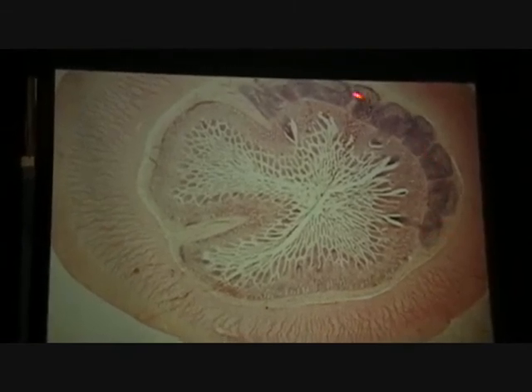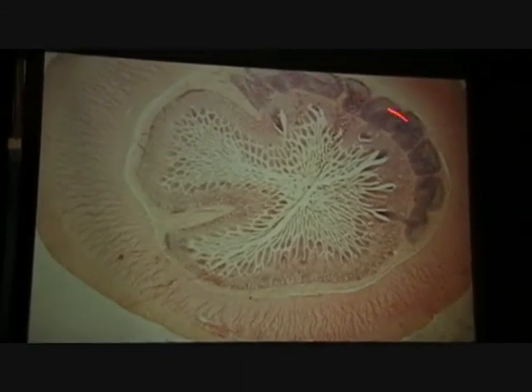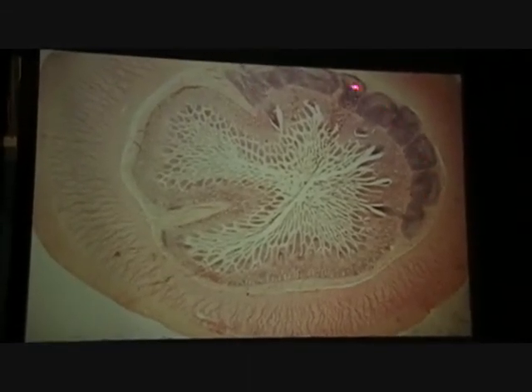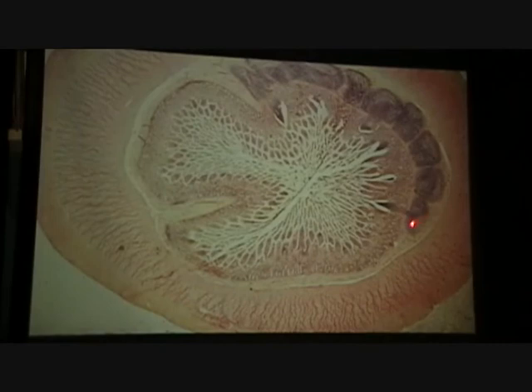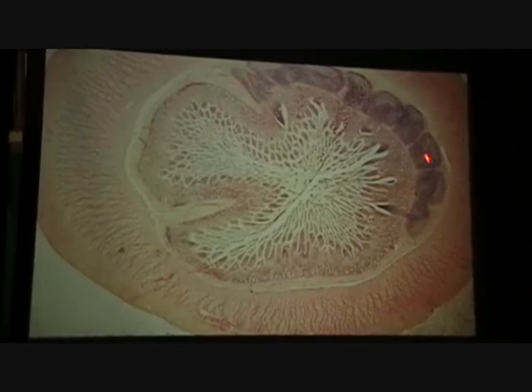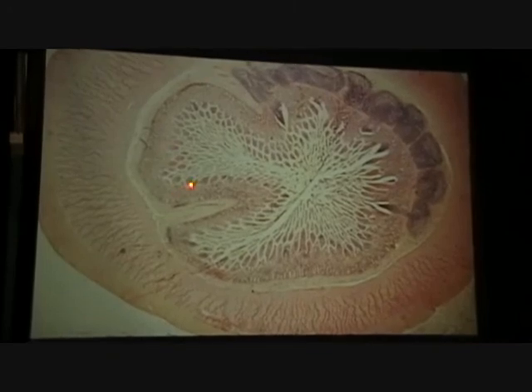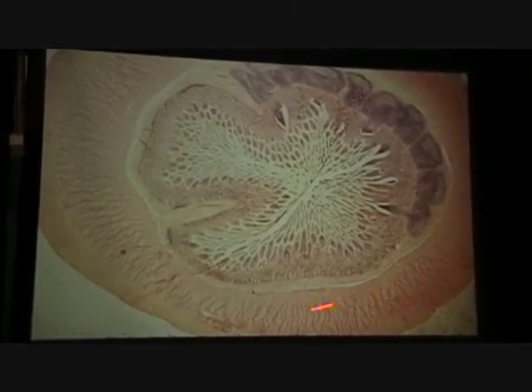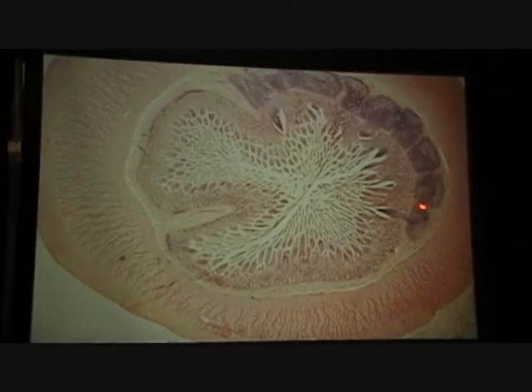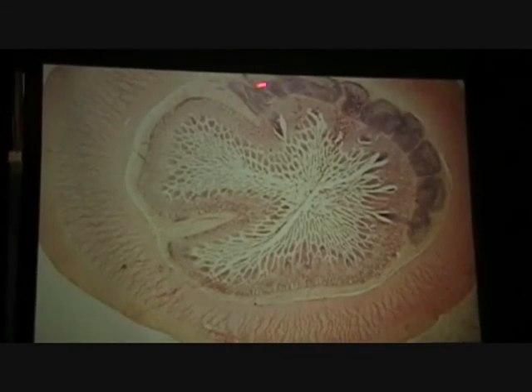Yep. All these purple dots are lymphocytes. Even lymph nodes linked together here. So you know that's a Peyer's patch. Always make sure you get a good one in the field. Tells you where you're at. Peyer's patch equals ileum. This is the lymphatic tissue or the tonsils of the ileum.